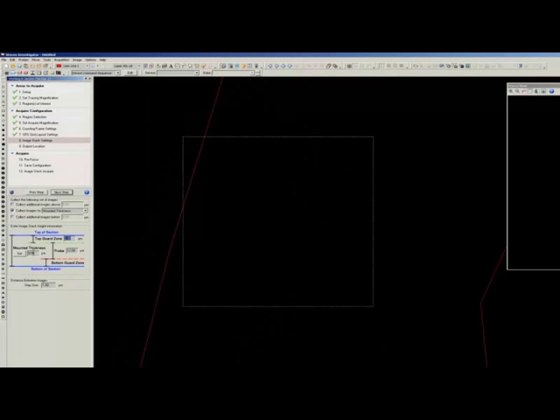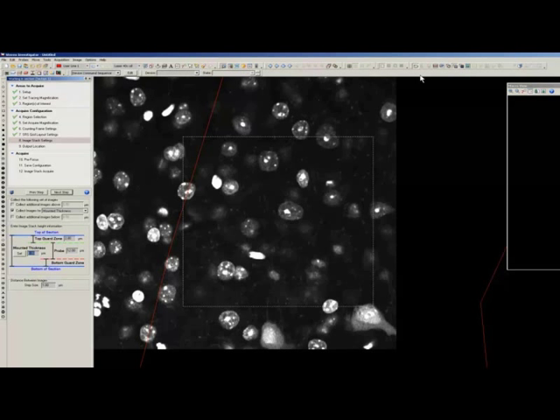In step 8, we will be setting our guard zone heights, our probe heights, as well as our mounted thickness height. The mounted thickness height can be obtained empirically. Again, hitting the live camera button, we've already previously selected that we wanted to use the laser from the confocal.